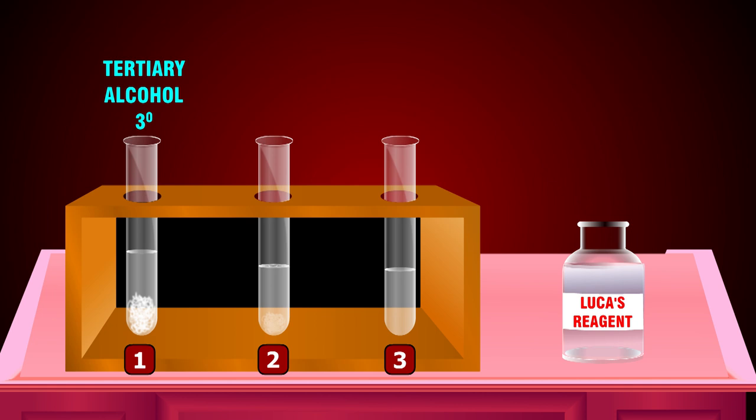In test tube number 2, turbidity appears slowly. This test tube contains a secondary alcohol.